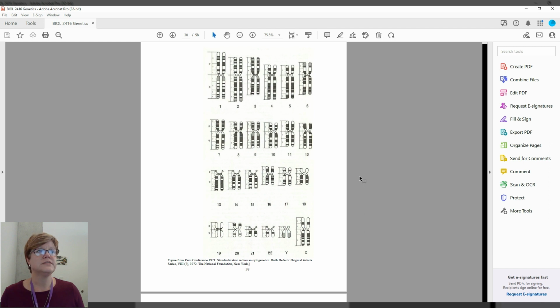The number 2 is the chromosome number. These chromosomes are shown in the dyad form because when the chromosomes are photographed in real life, they are always photographed after S phase. It's just logistically a better time to do that process. So to mimic that, these are shown as dyads. However, you're not seeing homologous pairs because there's no need to show 2 copies of chromosome 1. So just 1 copy of chromosome 1 in the dyad form, 1 copy of chromosome 2 in the dyad form, and so on. So 2 is the chromosome number.